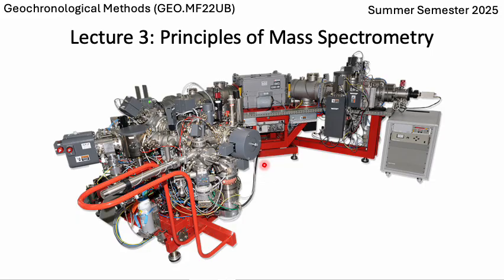But what I'll talk about today is kind of the general overview of mass spectrometry, because any mass spectrometer we look at will have some of these components. What's really different between different techniques and different mass spectrometers, for the most part, is how you actually ionize your material and put it into the mass spectrometer. But the actual part about the mass separation is more consistent between different mass spectrometers. So we'll focus on that first, and then we'll talk about different applications, different kinds of instruments.